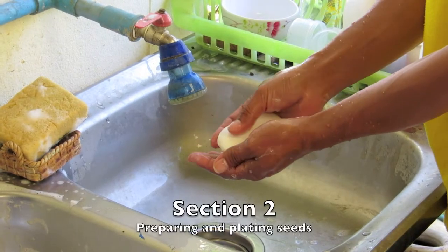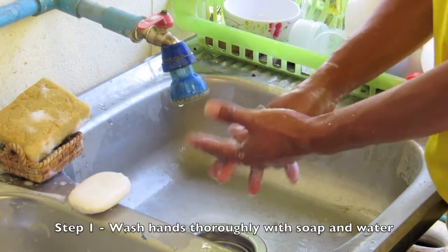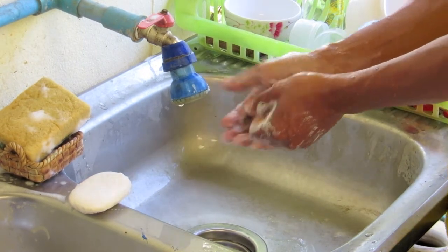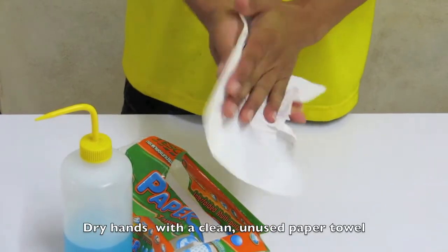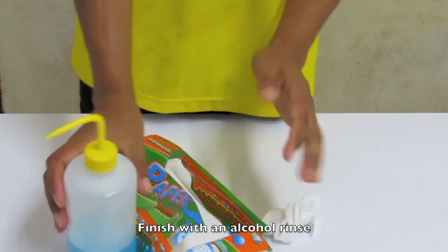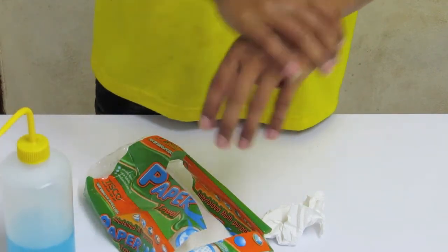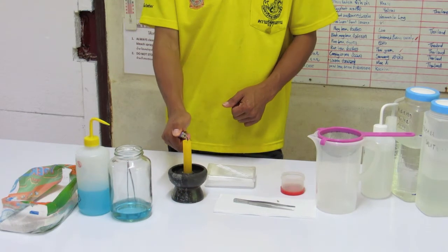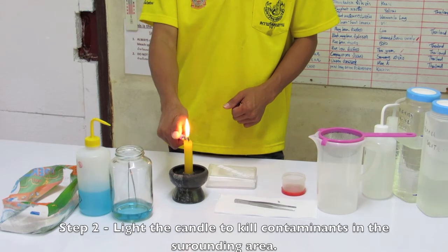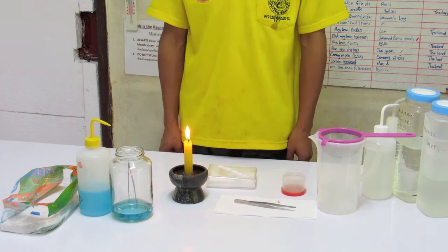Section two: preparing and plating seeds. Number one — first, wash your hands thoroughly with soap and water, dry them with a clean unused paper towel, and finish with an alcohol rinse. Number two — now light your candle. The candle aids in killing microscopic airborne contaminants and helps to prevent contamination of the petri dish and paper towel.